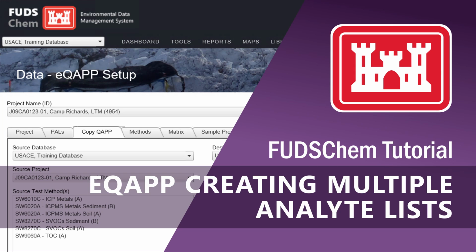You have matrices with different quality control criteria. You have matrices with different project action limits, PALs. You have two contractors or labs working within the same project and need to differentiate between them.